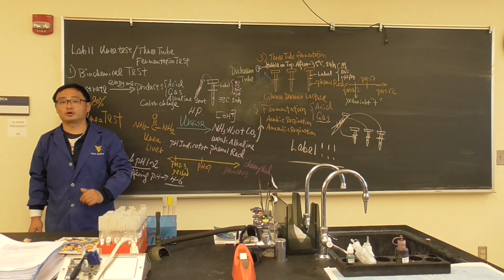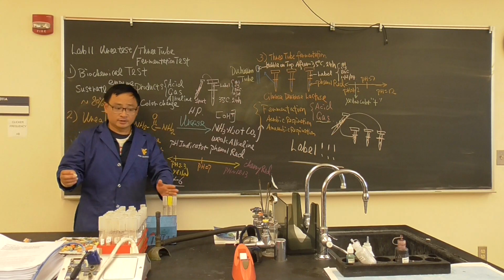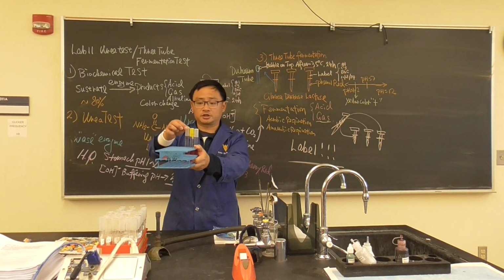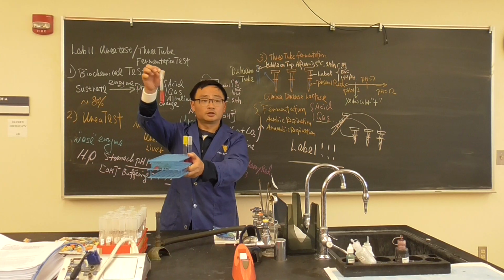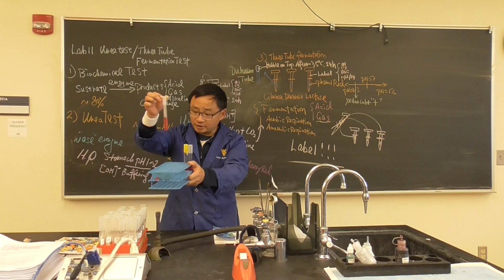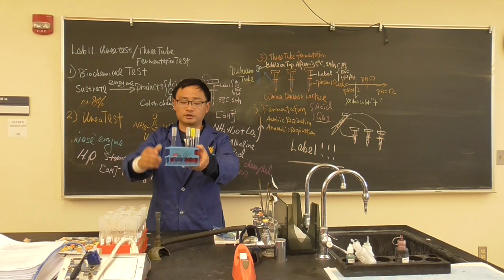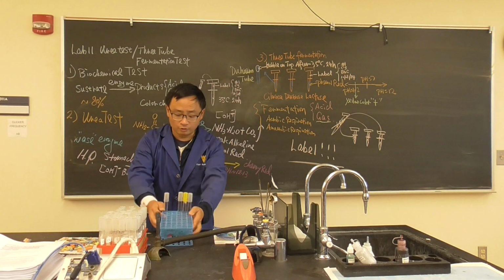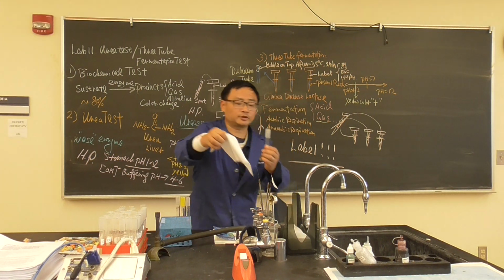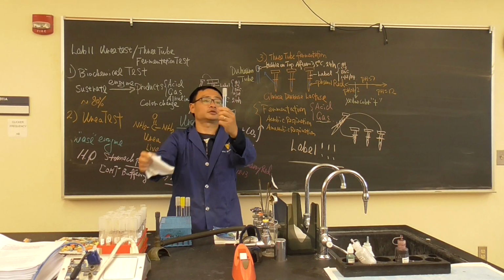So listen to Rion's order on how you do it. And these look very similar. This is also a cap tube. Don't hold it like this. This is the number one accident in the lab. It is very easy to fall off. It's inside another tube, so have your rack to grab all these things. You can keep a little distance. When you come here, this might be wet. Use your paper towel. Make sure you clean and dry these first.